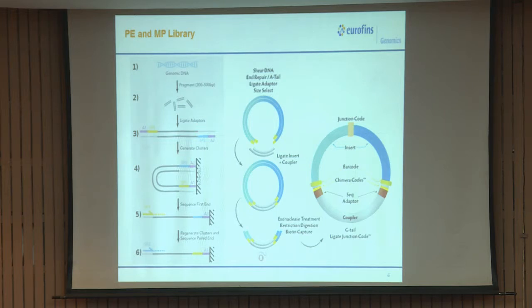Now, Illumina sequencing chemistry is a bridge amplification. What is the bridge amplification? In my flow cell, I will have a one complementary pair of the adapter. Now, this will attach and it forms a bridge. This is how. So, this is getting attached.